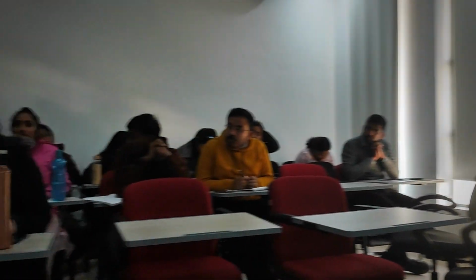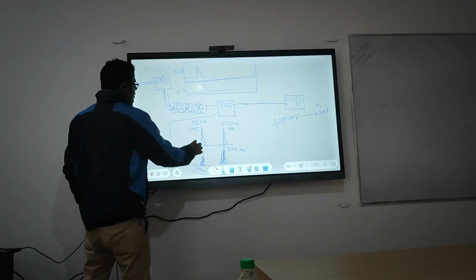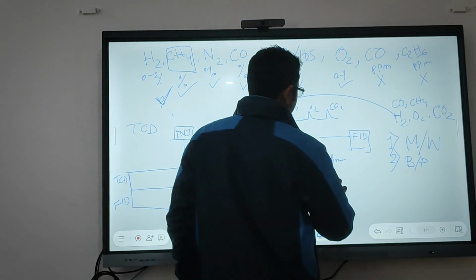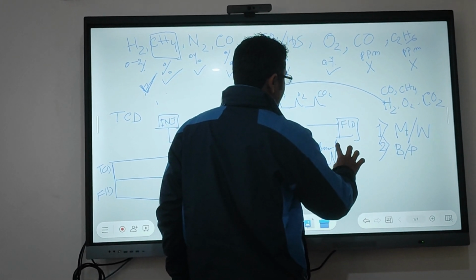Detection. Any other? Separation. The column is not detecting anything, only separation. So if we have all data preserved, with carrier flow, every time your peak timings are written. You may get each component, hydrogen combination, peak of oxygen.